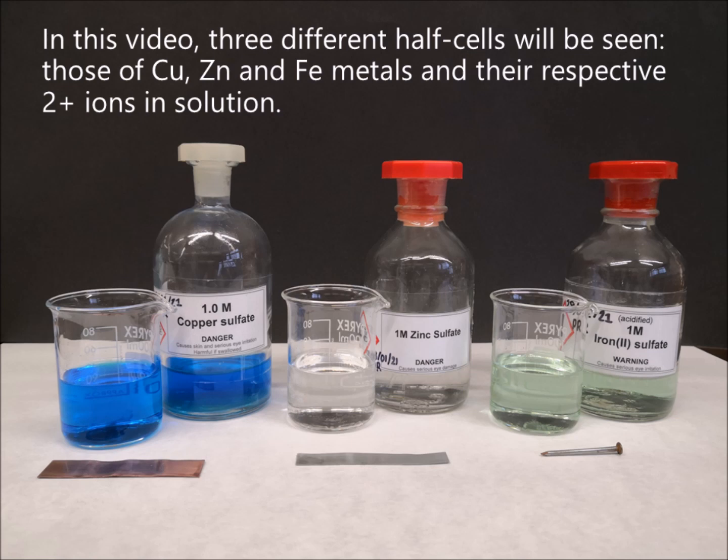In this video, three different half cells will be seen — those of copper, zinc and iron metals, and their respective 2+ ions in solution.